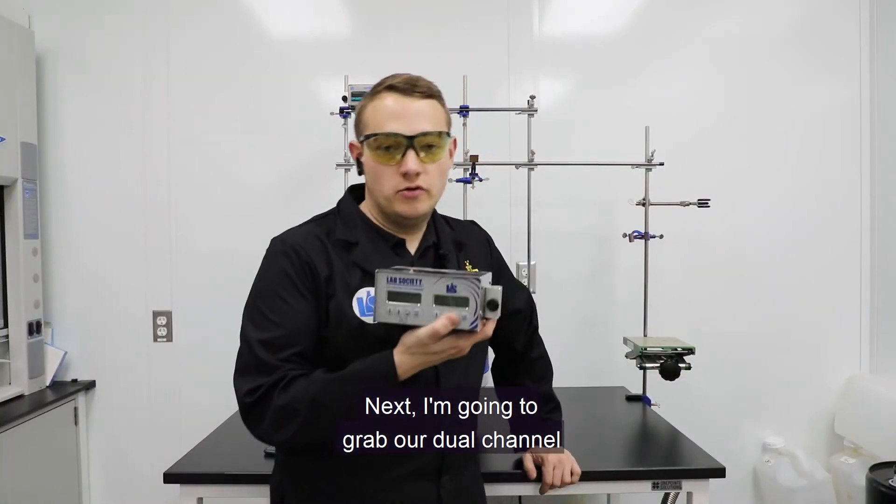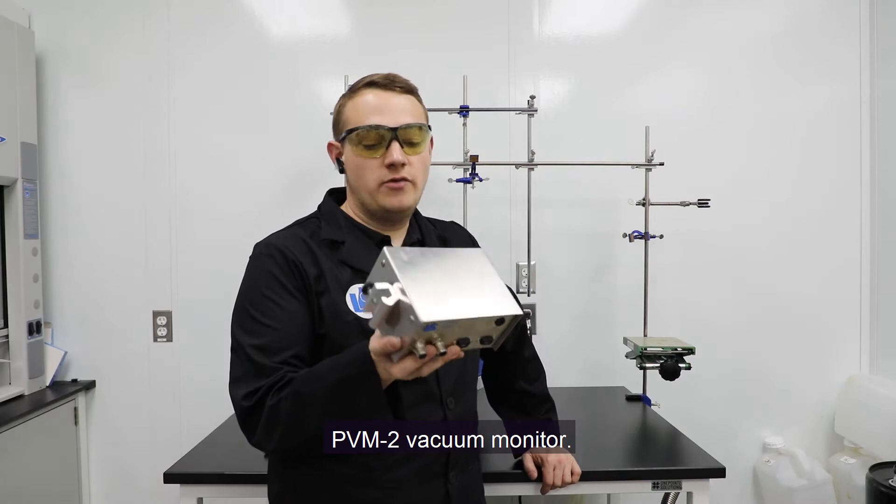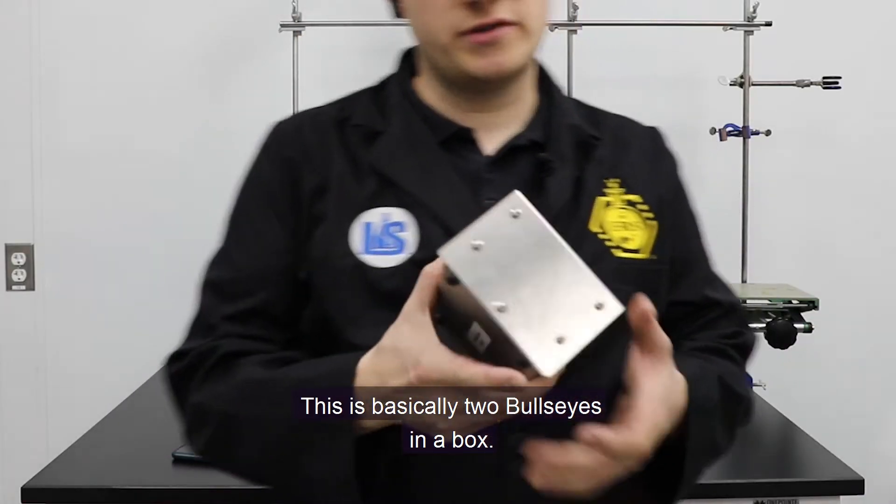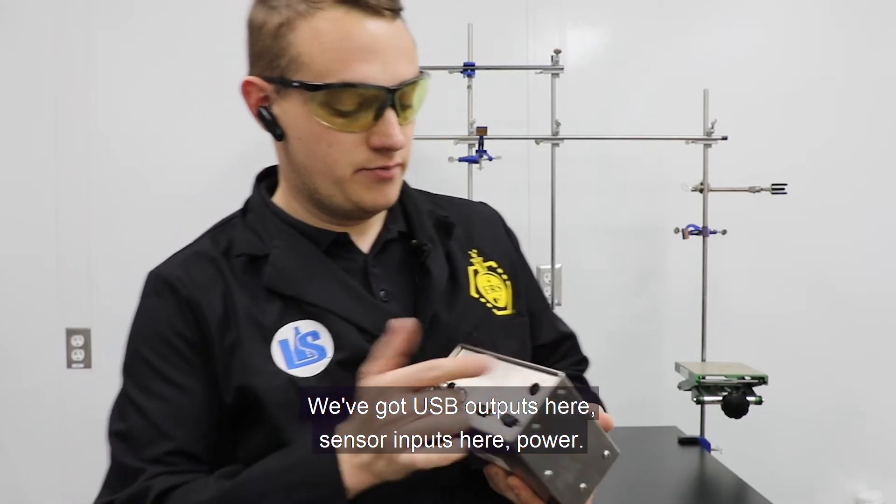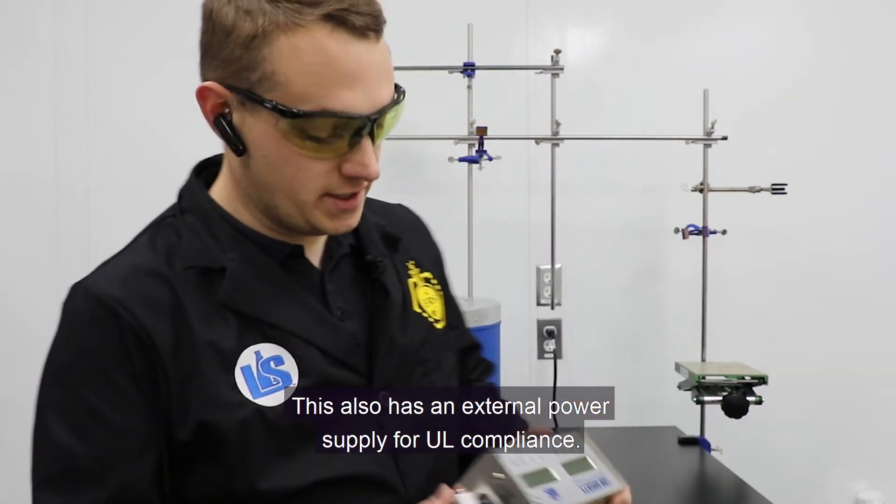Next, I'm going to grab our dual-channel PVM2 vacuum monitor. This is basically two bullseyes in a box. We've got USB outputs here, sensor inputs here, power. This also has an external power supply for UL compliance.